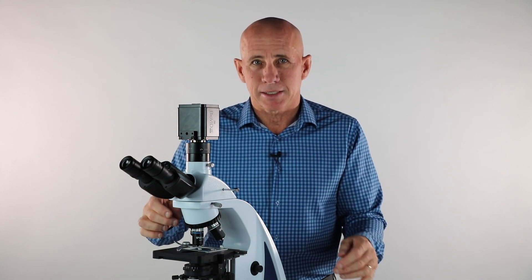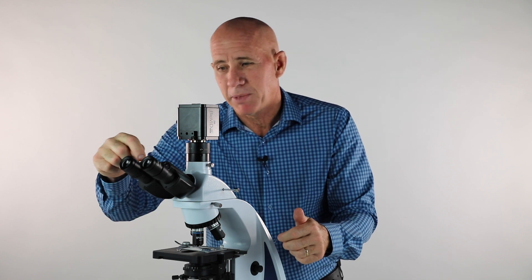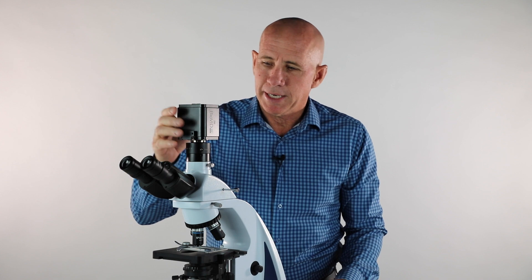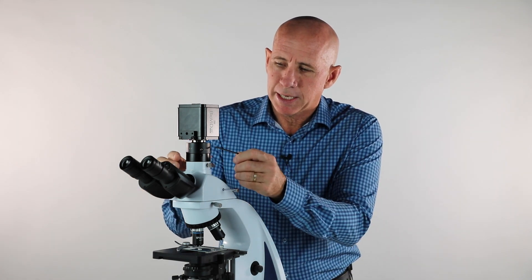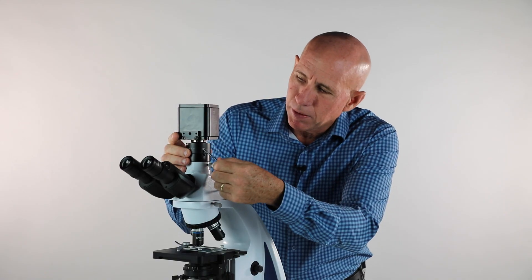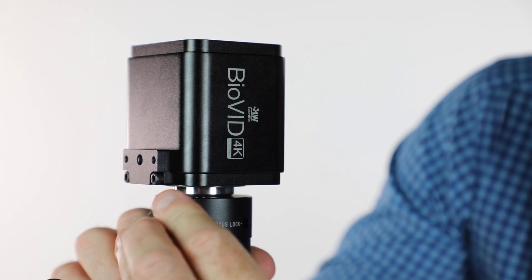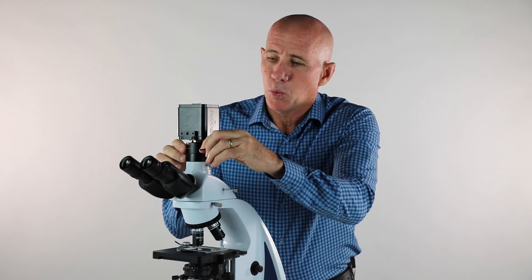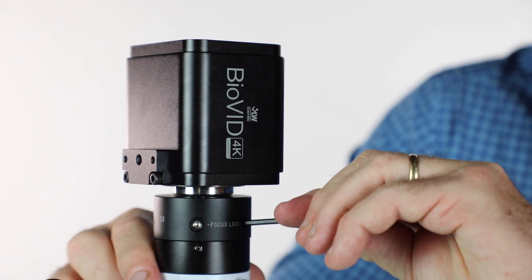Find something very distinct on your slide — one cell, for example — and focus on it through the eyepieces. Make sure your diopters are set correctly, meaning zero to the dot. Once you have something in focus through the eyepieces, look at your camera screen — it may be a little blurry. Take your Allen wrench, insert it into the lock on the trinocular pipe, and loosen it. While watching the camera screen, turn the focus until the image matches what you see through the eyepieces. Once it matches, lock it back down and you won't have to touch that again.